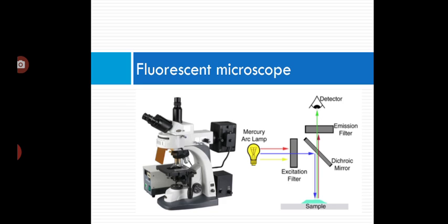Fluorescent dyes, also known as fluorophores or fluorochromes, are molecules that absorb excitation light at a given wavelength, generally UV, and after a short delay emit light at a longer wavelength. The delay between absorption and emission is negligible, generally on the order of nanoseconds. Emission light can then be filtered from the excitation light to reveal the location of the fluorophores.